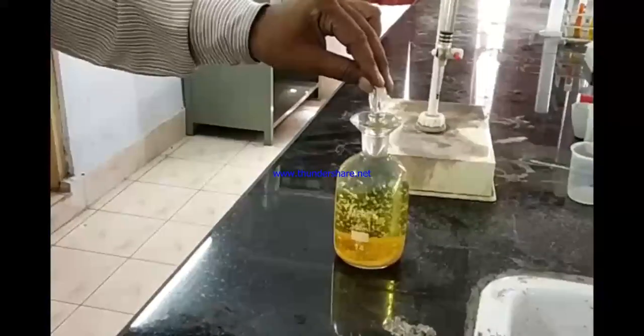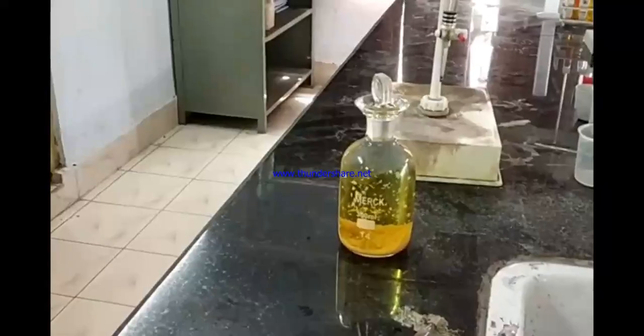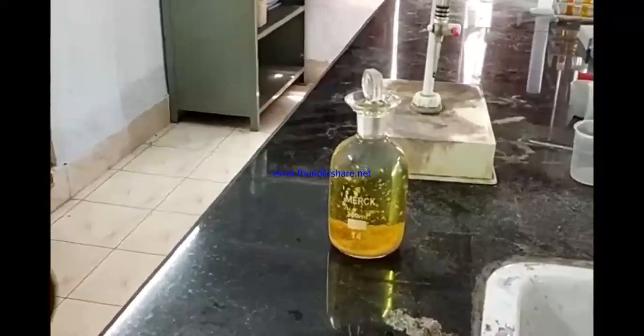We'll give a little bit of motion. थोड़ा सा इसको shake कर देंगे, ठीक है ना, so that proper mixing takes place. Very carefully you have to shake it, और देखिएगा एकदम dissolve हो जाएगा. देखिए सर, carefully थोड़ा सा शेक करेंगे, because concentrated H2SO4. This is the shaking, and everything will get mixed up, and a clear bottle you will see, where clear transparent color has been developed.